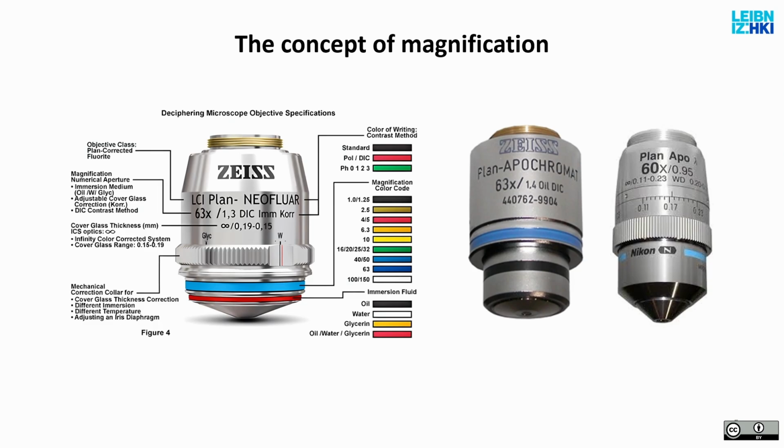If you have such a collar and you don't set it right, and some of you answered properly on that, this will ruin the point spread function, basically, not ruin, but makes it worse than it could be and should be. So it's important that you set this up properly.